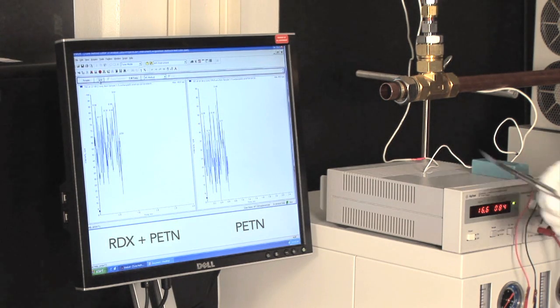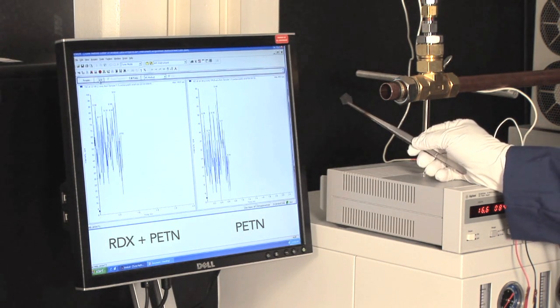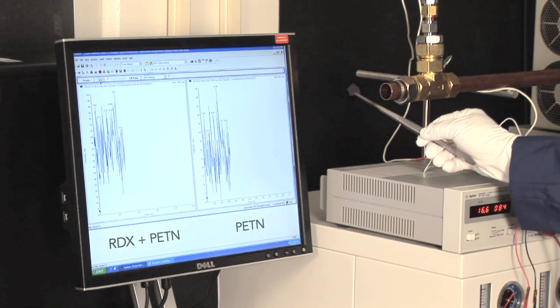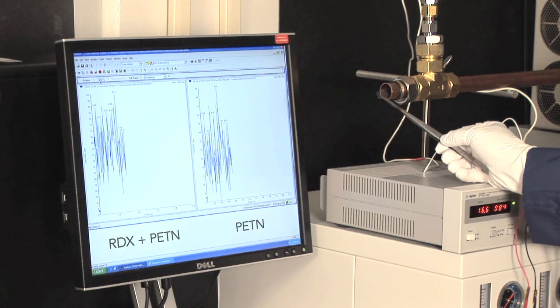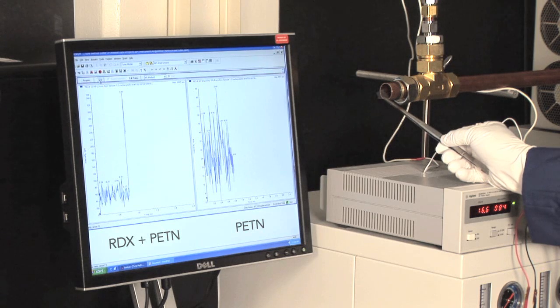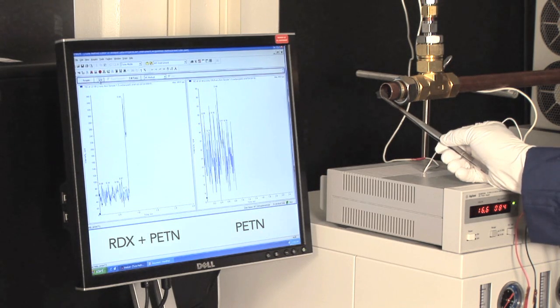Here is a similar glass slide that was spiked with about 5 micrograms of RDX over a year ago. When we sample the vapor coming off the glass slide, we see the response to RDX on the left side of the screen, but no PETN response on the right.